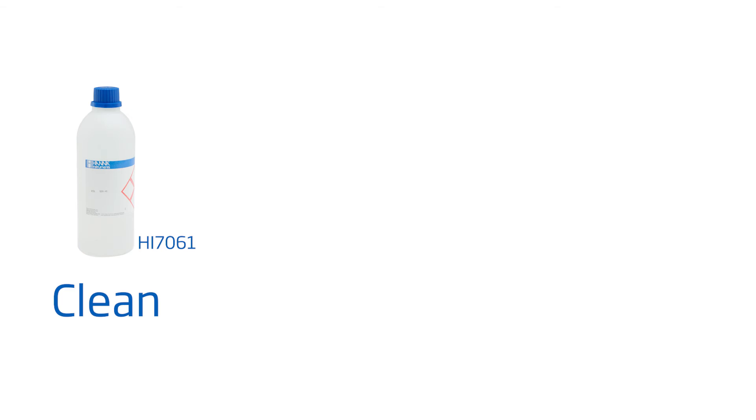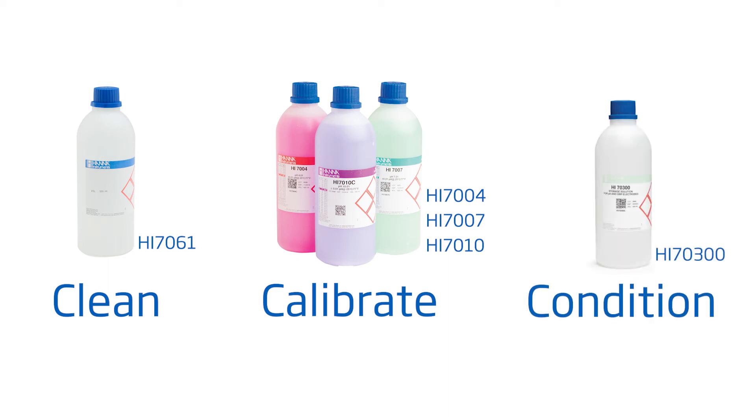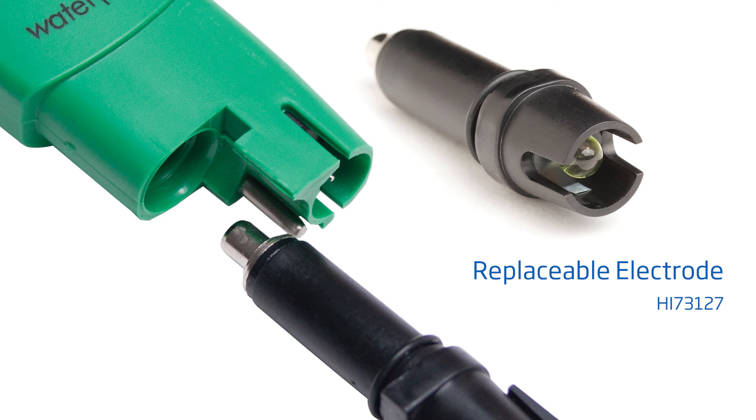To get you started right away with best practices, here are some tips to follow for the best results. Clean your tester with pH electrode cleaning solution, our HI7061, for at least 15 minutes once a month. Calibrate with Hanna pH buffers before each use. When you're not using your tester, keep the probe conditioned by keeping it in electrode storage solution, our HI70300. And if you notice your tester giving you erratic readings, your pH probe is replaceable with our HI73127.